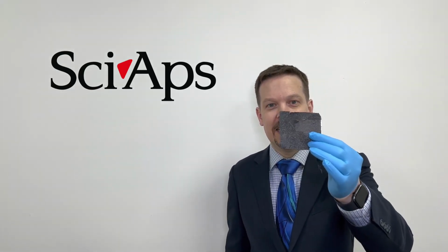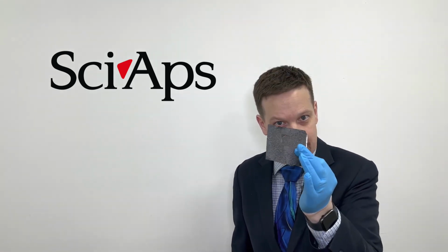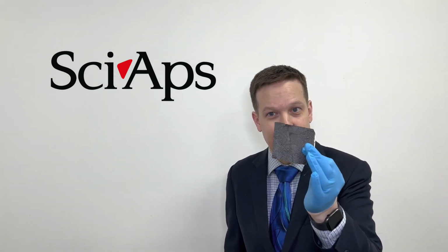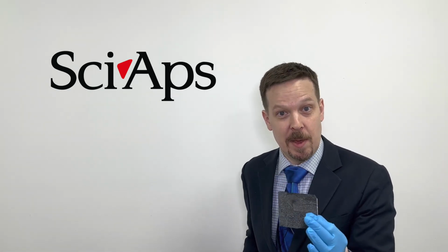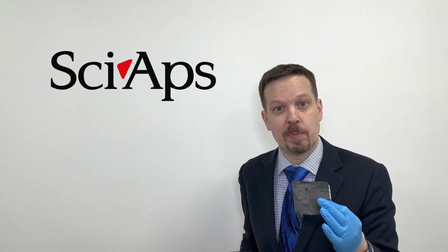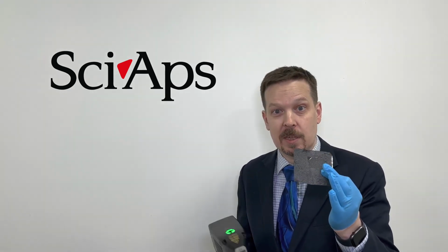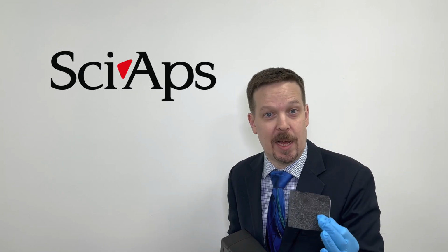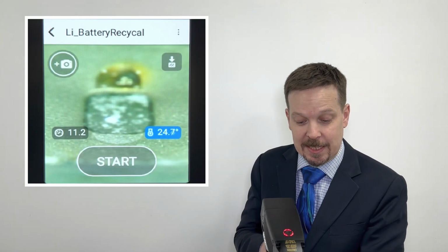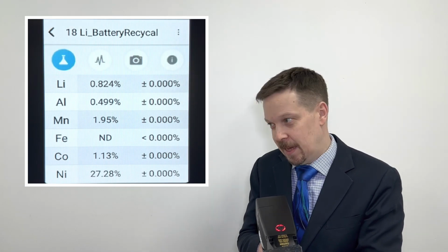So here is an individual layer of a lithium ion battery. And what the recyclers are going to do is they're going to take this component and they're going to test just the individual layer using TMA. So we've built a curve for black mass, but now what we're doing is taking that individual curve that we use cleaning shots and data pulses for, and we're going to convert it into just one data shot and get the results. So we're going to test this sample. It's a very quick test, and you'll get the result right away, as seen here.